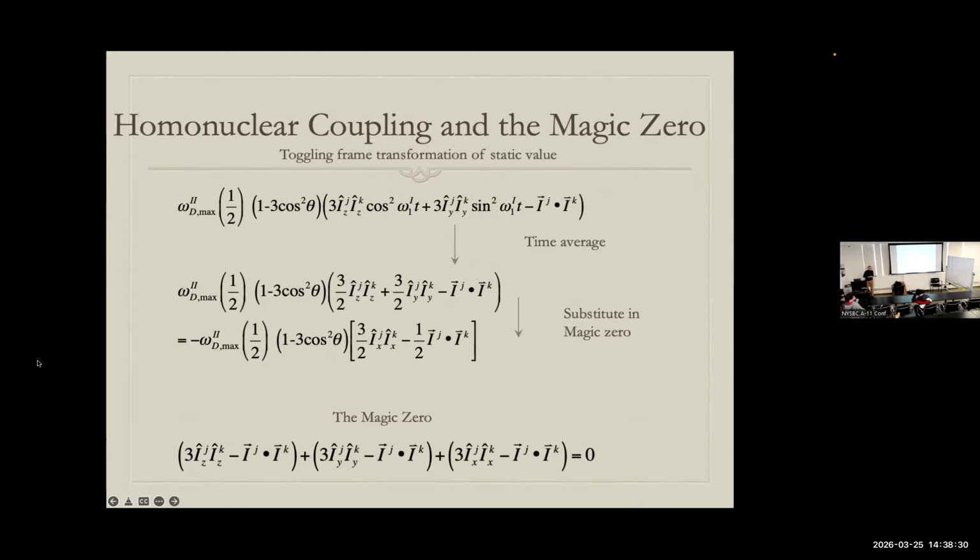So in your derivation, you started with X magnetization and the RF pulse was also in the X. Does there need to be that relationship between the initial magnetization and the RF pulse for this theory? Absolutely. There are experiments we do that don't have that geometry, and they operate differently, and they're not always that much worse in practice.